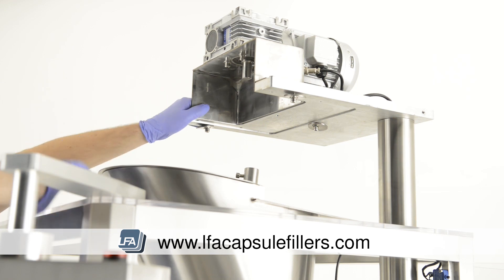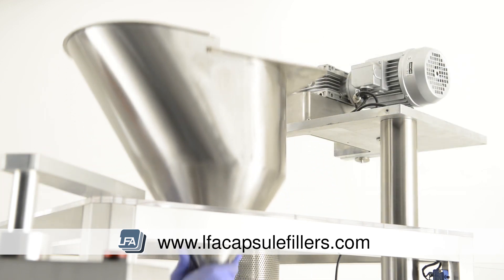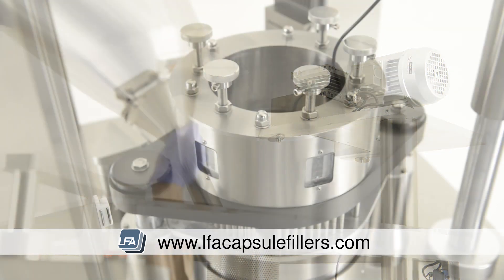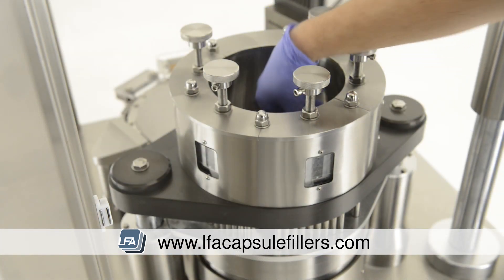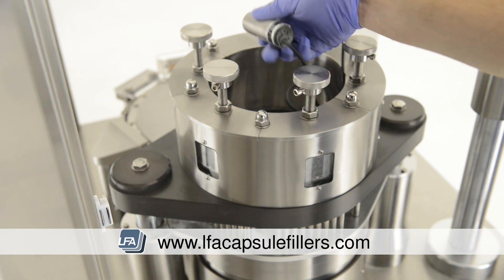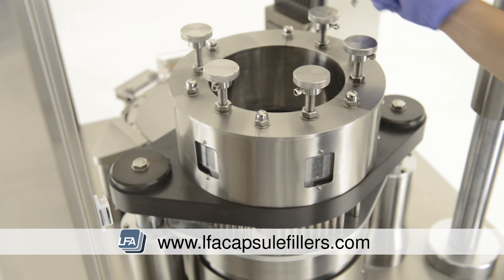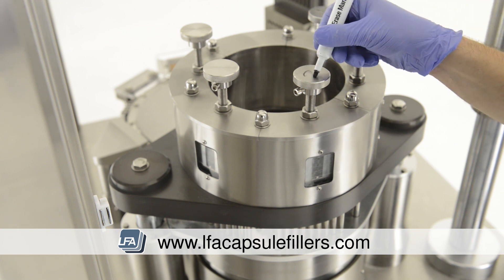We now need to remove the auger paddle so we're able to remove the hopper. Rotate the top section so it's out of the way — you're then able to lift the hopper out of the machine. We suggest two people to do this. The next task is removing the sensor: follow the cable down the centre of the tamping turret, pull out the sensor, and place it to one side.